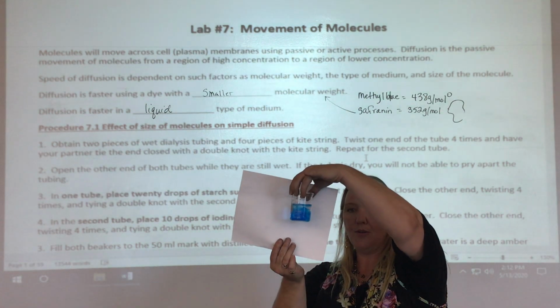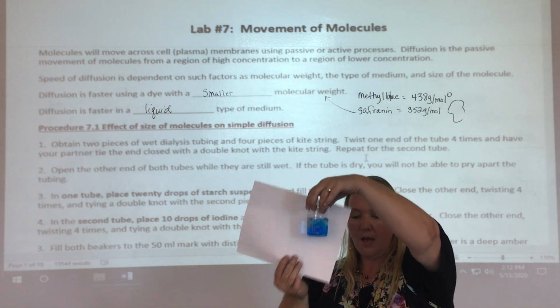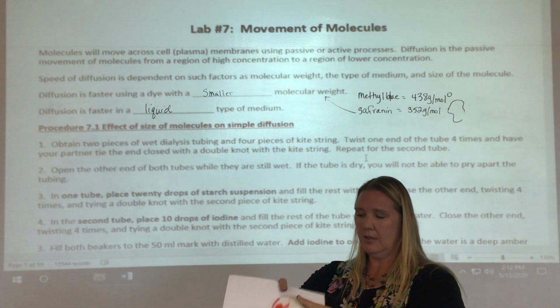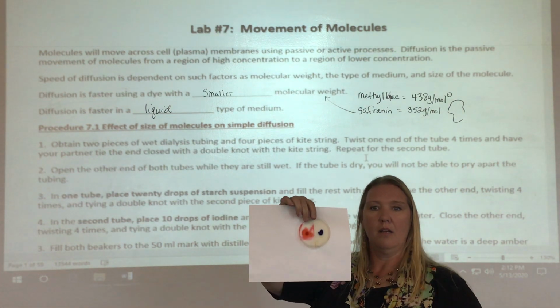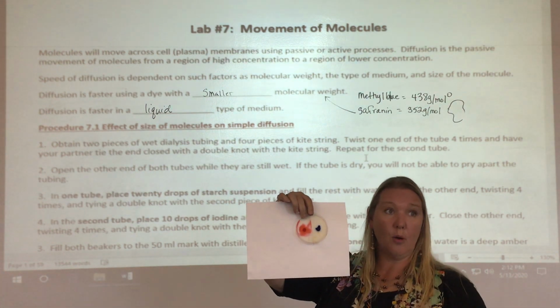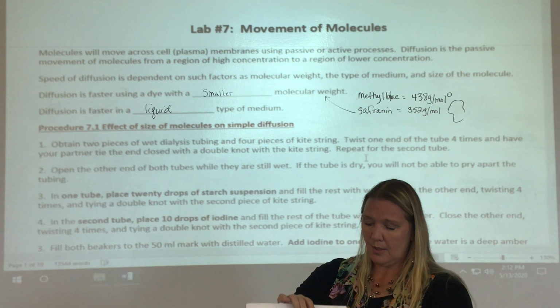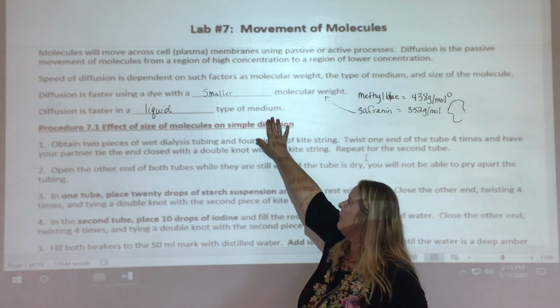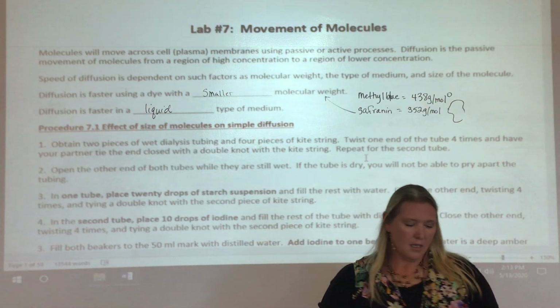This is all the way through now, okay? And so it only took a couple of minutes where this blue was like 3 hours or more. And so you can tell that it is a much quicker process, depending on what it's moving in, okay?